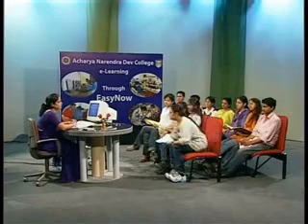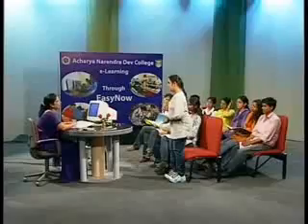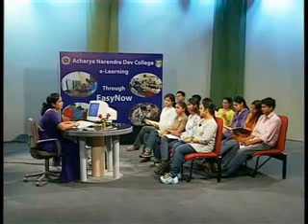Ma'am, can we use dilute HCl in place of dilute H2SO4 in the nitrogen test? As I told you when we discussed the chemistry of the nitrogen test, what is the role of dilute sulfuric acid? When we add dilute sulfuric acid, the ferrous hydroxide and the ferric hydroxide become soluble in it. With dilute HCl also they will become soluble and ferric salts will get converted into ferric chloride. But ferric chloride itself is yellow in color. So the Prussian blue color, because of the nitrogen, and the yellow color due to the ferric chloride, give a green color in the end. To avoid that side reaction, that is, to observe the exact color change, the Prussian blue color, we should avoid the use of dilute HCl.